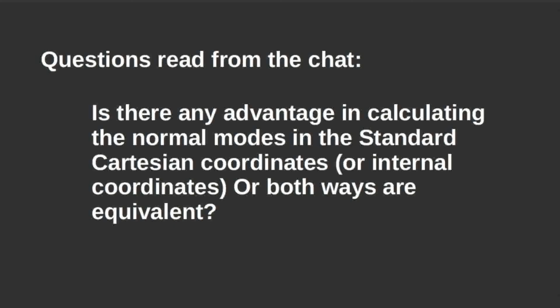Now, when we speak about internal coordinates, we are speaking about atomic structures, okay? All these methods, in principle, in the beginning were developed mostly for when you don't have an atomic structure. Now we are having more and more atomic structures every day.